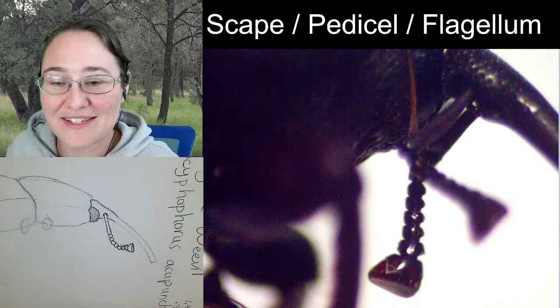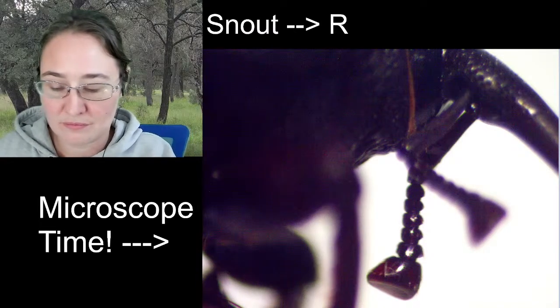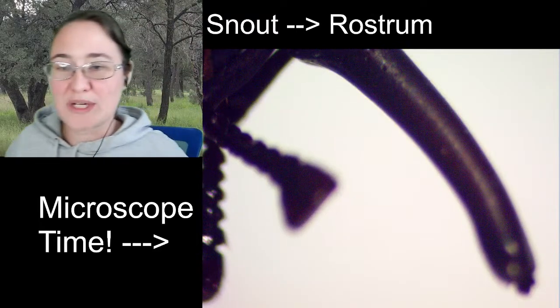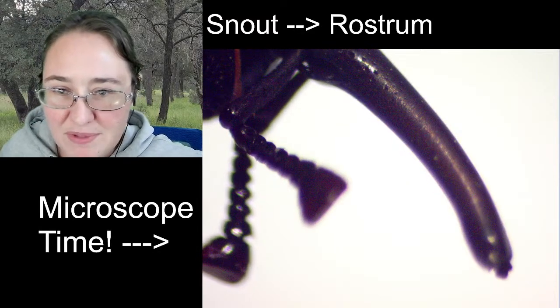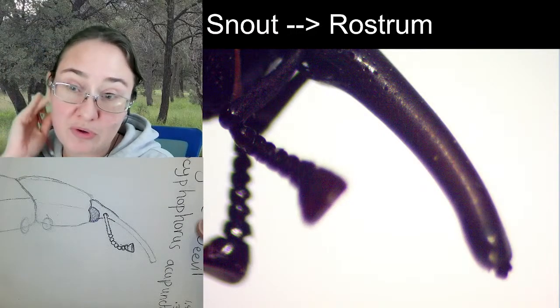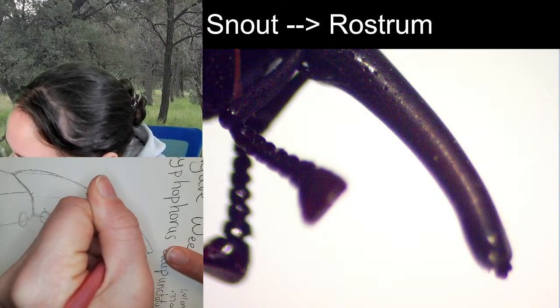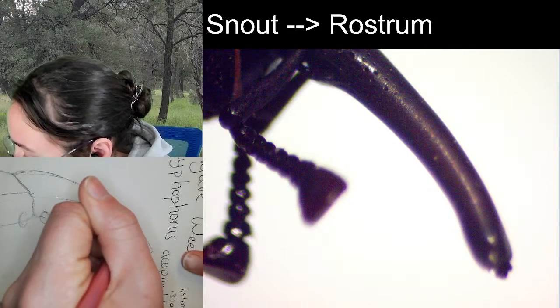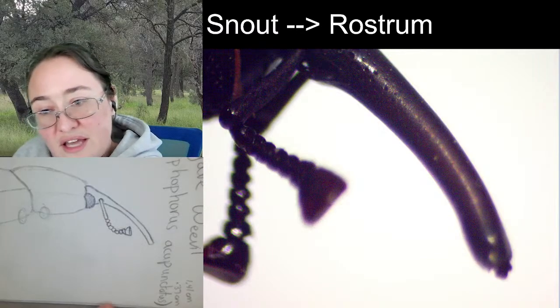Now all we have to do is look at its snout. Let's see. And we did talk about this earlier, that the punctations are all those little dots. They are pretty heavy on the head, but then as they go down the length of it, it's a little bit more smooth, I guess, is the way to say that. Make sure to leave a little bit of room at the end for those mandibles. So I'm pretty happy with the length and width of my rostrum. So I'm just going to darken what I had already kind of estimated. I'm seeing that it's very smooth, and as long as it stays, yeah, I'm happy with that.